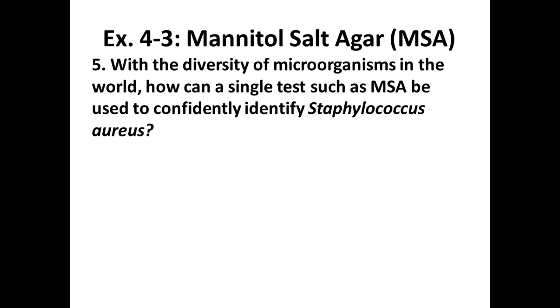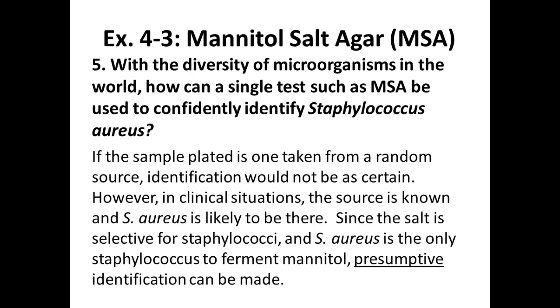If someone gave you a specimen, could you put it on mannitol salt and know right away that it's Staphylococcus aureus because it turns yellow and it grows? No, right? It could be something else. But in a clinical specimen, chances are you're probably looking at Staphylococcus aureus. This is a presumptive test, right? You would presume, but you would do further testing.